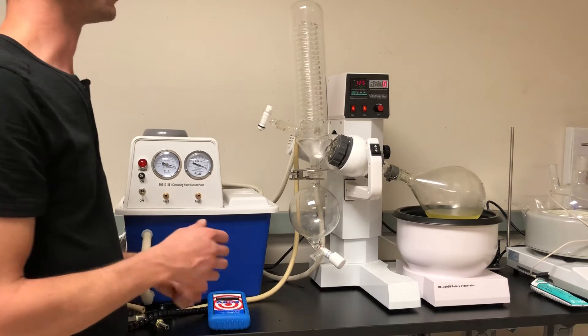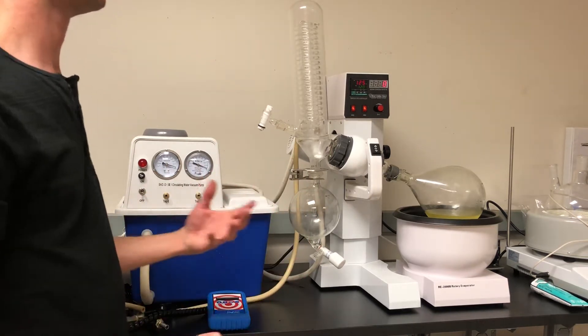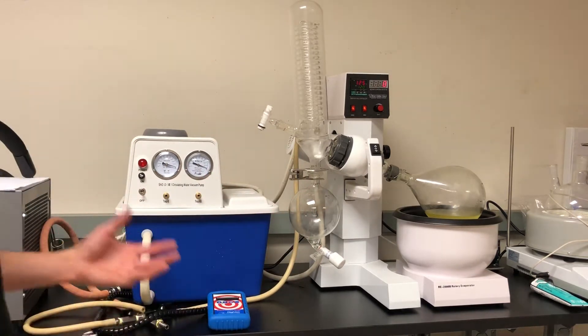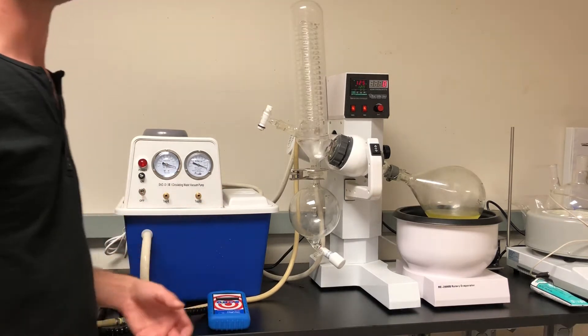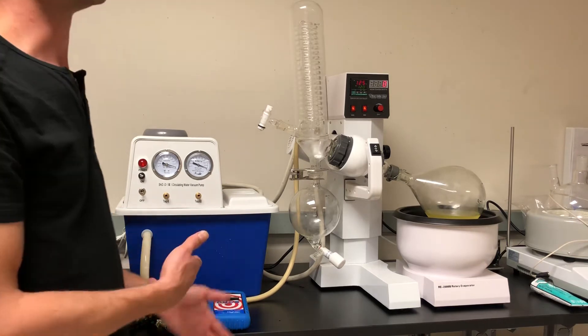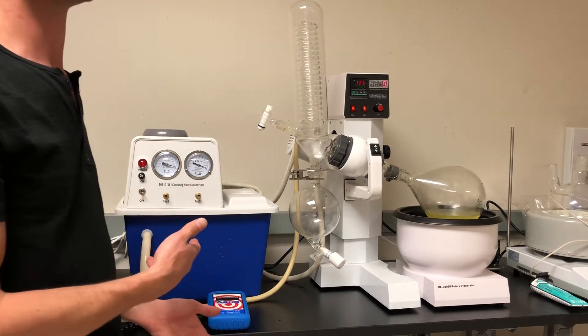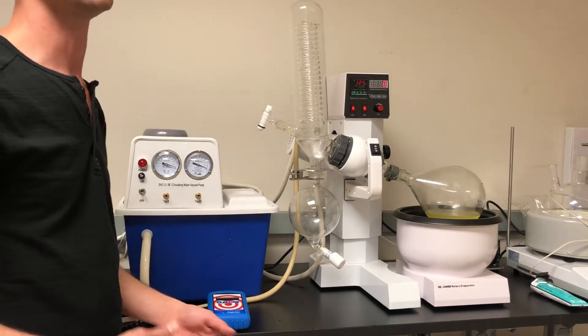This is really designed for the person who's using this system once or twice, maybe in a week or so, because it runs on ice. So if you have access to a lot of ice and ice is cheap, then you can run it as much as you want, but you are going to be changing out the ice every single time you run it if you want to run it for an hour.